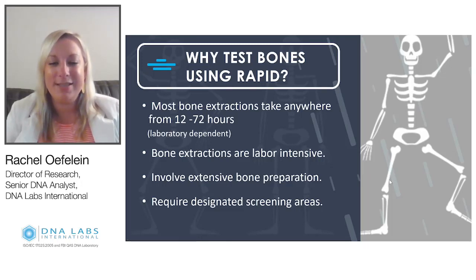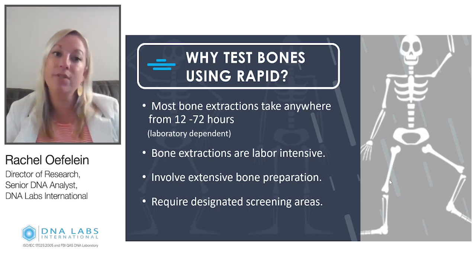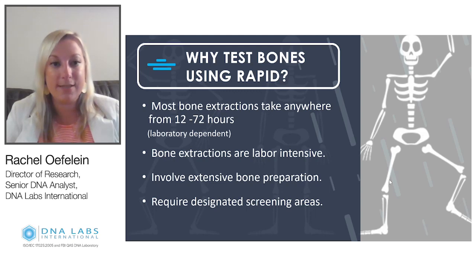I have noted here that this is laboratory dependent, but it's not actually just laboratory dependent because it's also bone dependent. So when we get really challenging bone samples, sometimes, for example, with our demineralization method, after that initial incubation, you might not have full demineralization. So we can respike that sample and give an additional incubation period. In addition to that, a lot of bones yield very small amounts of DNA. So one extraction might not even be enough. You might have to do 2, 3, 4 extractions. We have one genealogy case in particular where we had to do 8 extractions to get enough DNA to go forward with genealogy.